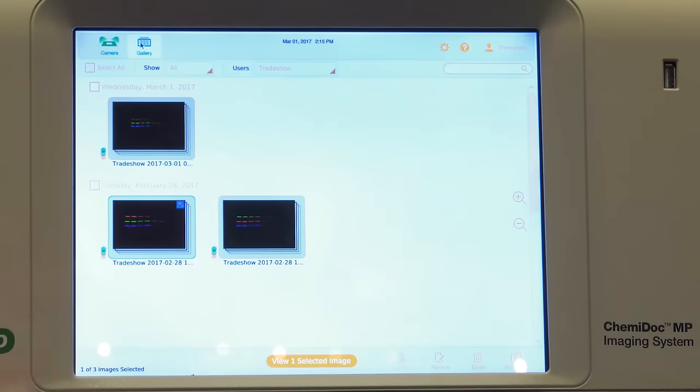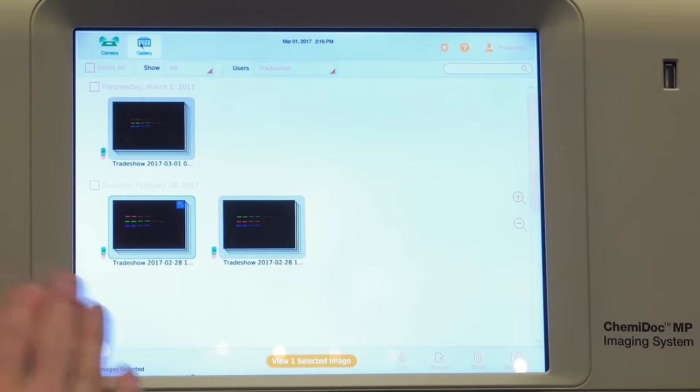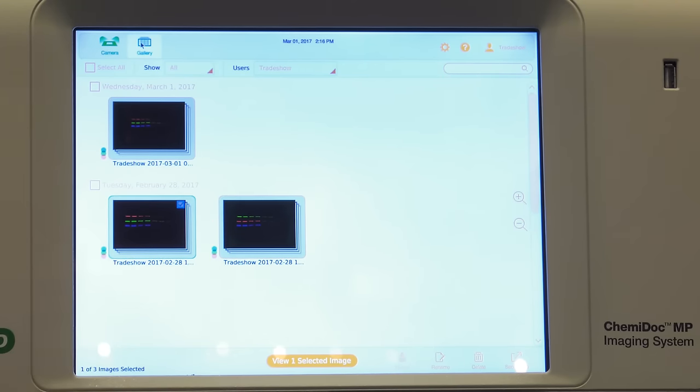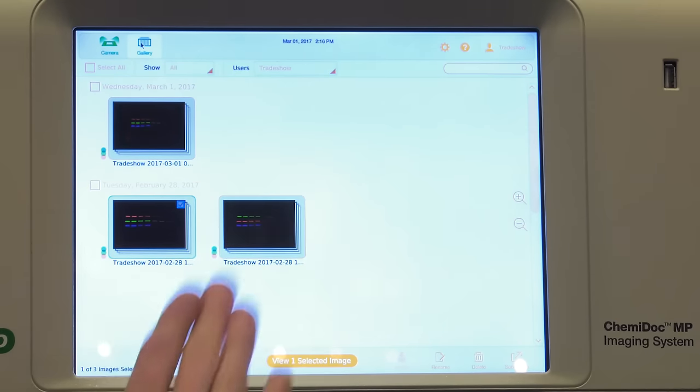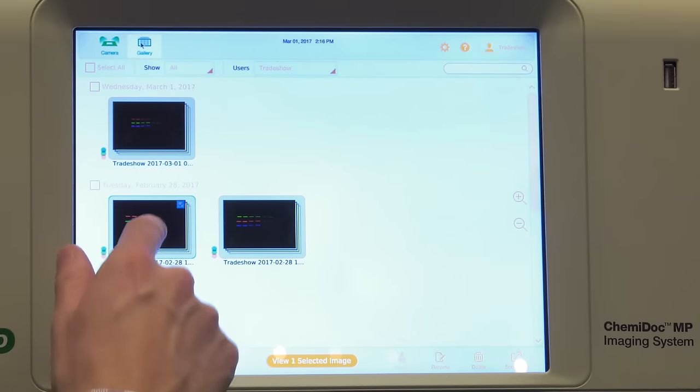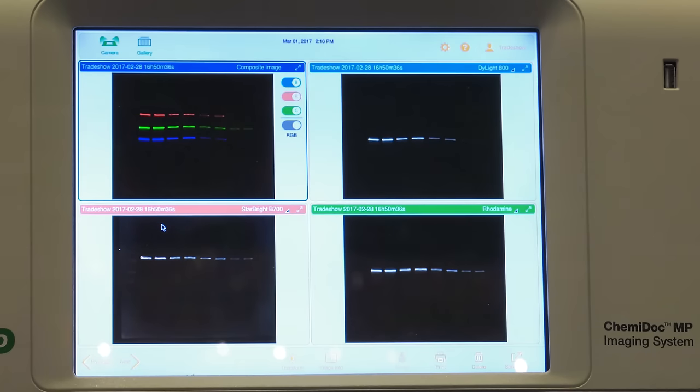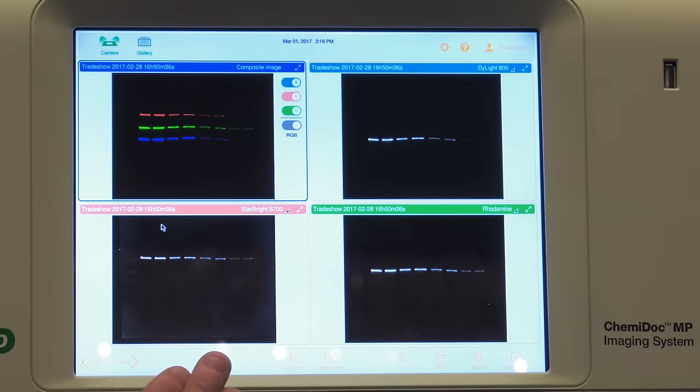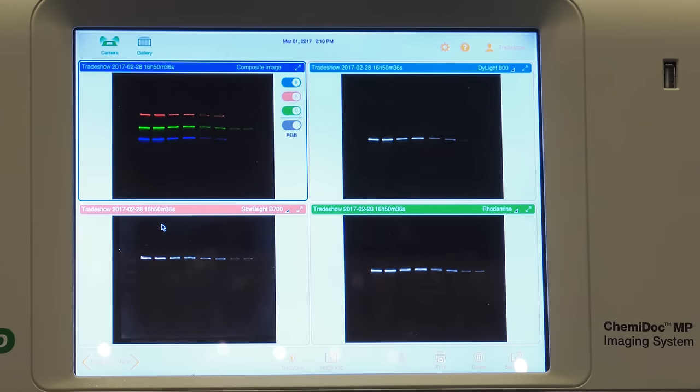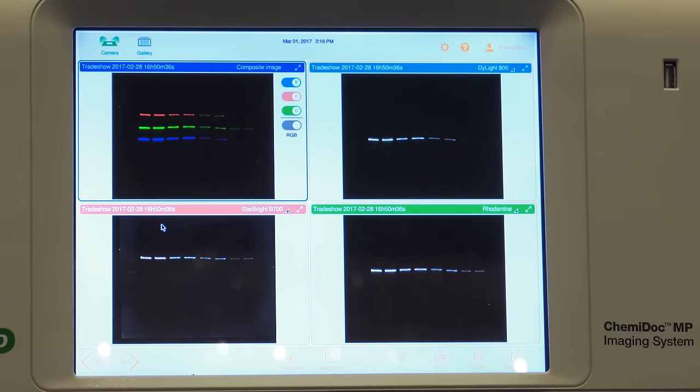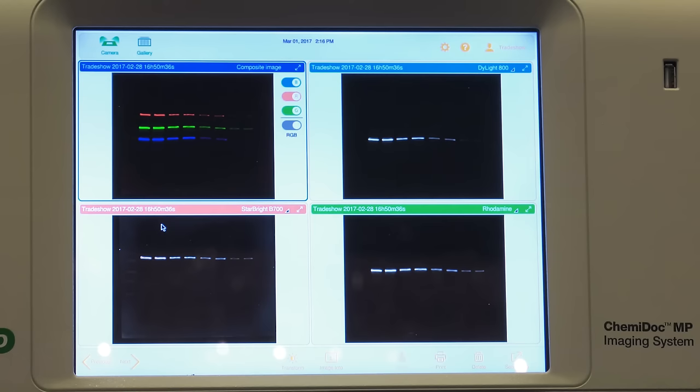So let's look at some previous results I've taken before. So here's an example of the gallery view. So once you go ahead and you acquire an image like I showed you before, you just go ahead and you say, okay, it's saved automatically. I want to look at it. Let's see what I've got. So here's an example. Just double click. What you're looking at here is a composite image of three-channel or a triplex experiment. So Western blotting. We're looking at Starbright B700. We're looking at Dylight 800. And we're looking at rhodamine, which in this case happens to be our normalization factor. So you're able to look at three targets on the same blot. That's really powerful. That's less blots that you have to actually process, you actually have to worry about.